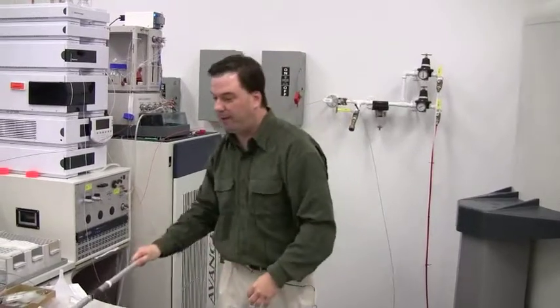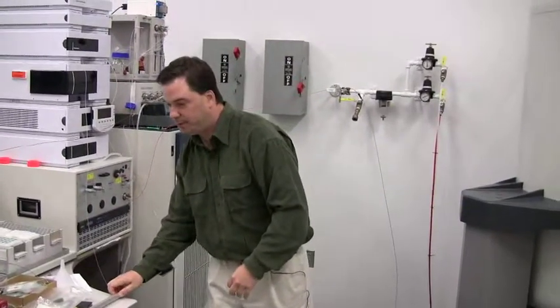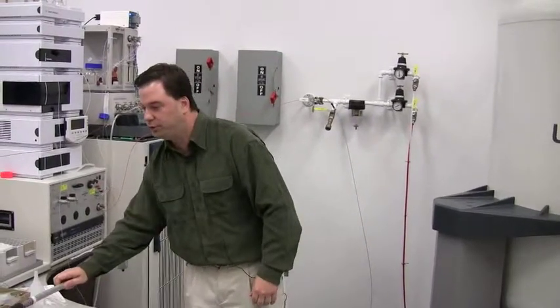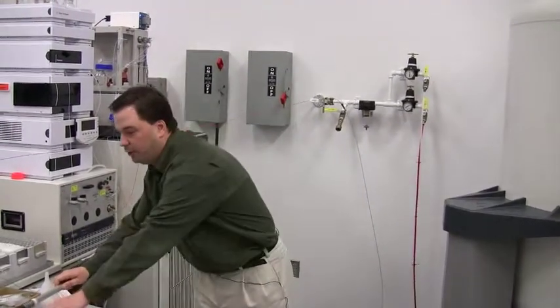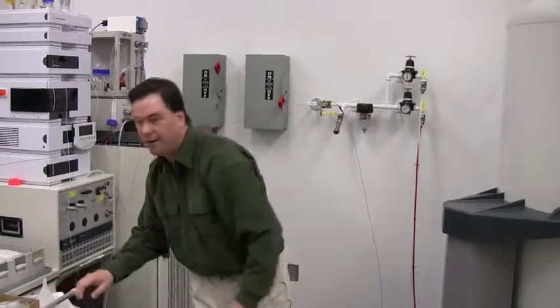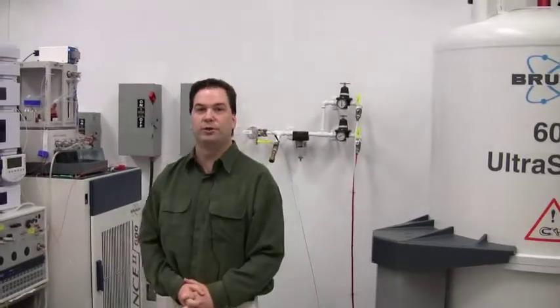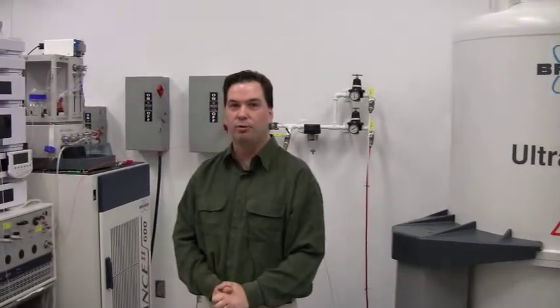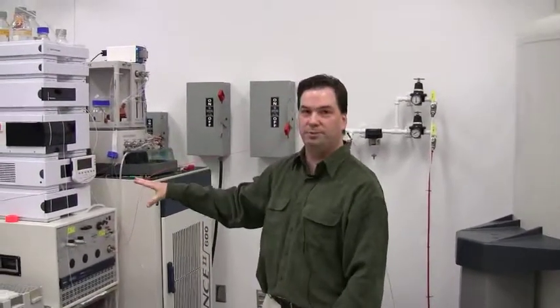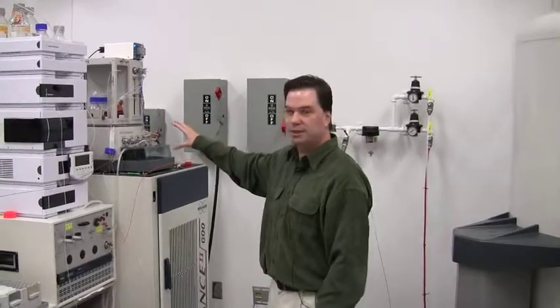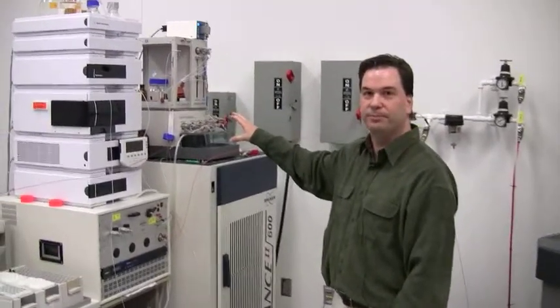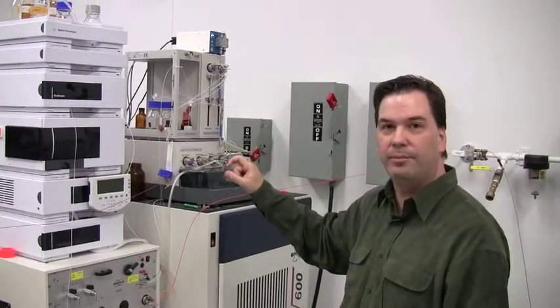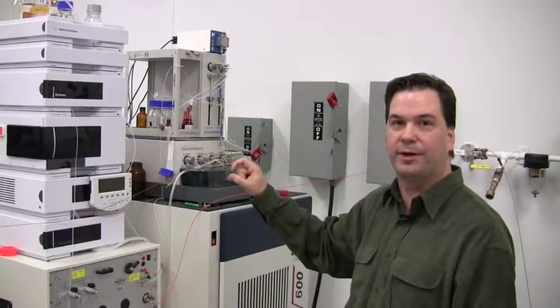The main drawback with this type of technology is that to do the direct flow requires using deuterated solvents, and as we know that deuterated solvents can be expensive. The alternative is if your material is not going to decompose and if it's relatively stable, we could actually send it from the HPLC and trap it onto a solid phase extraction station. This solid phase extraction station works like a mini column. It actually traps the material on the column.